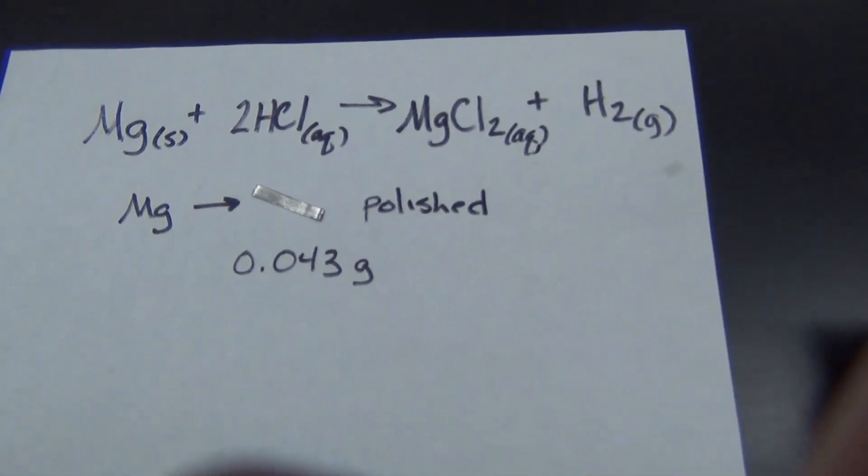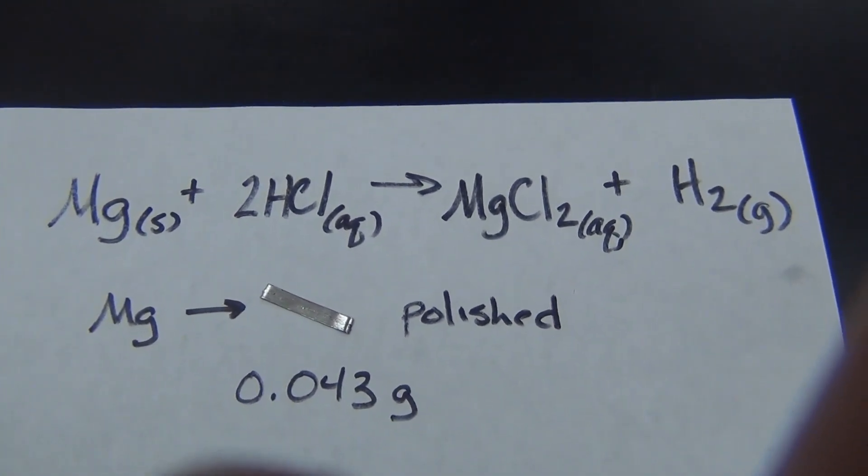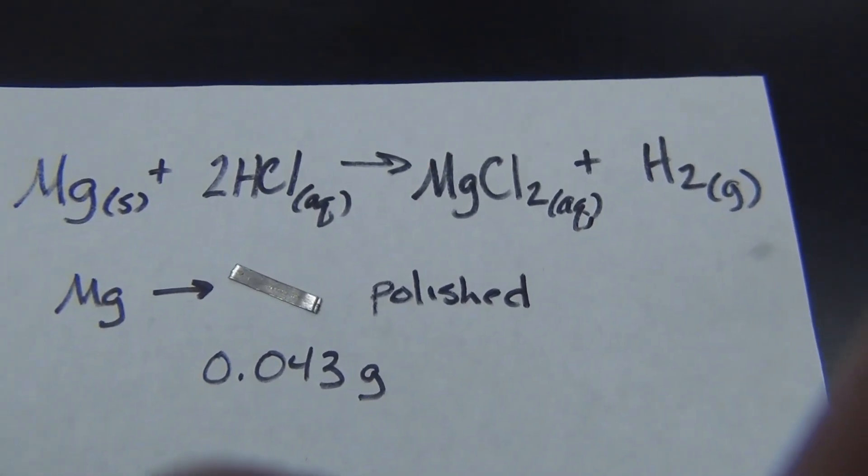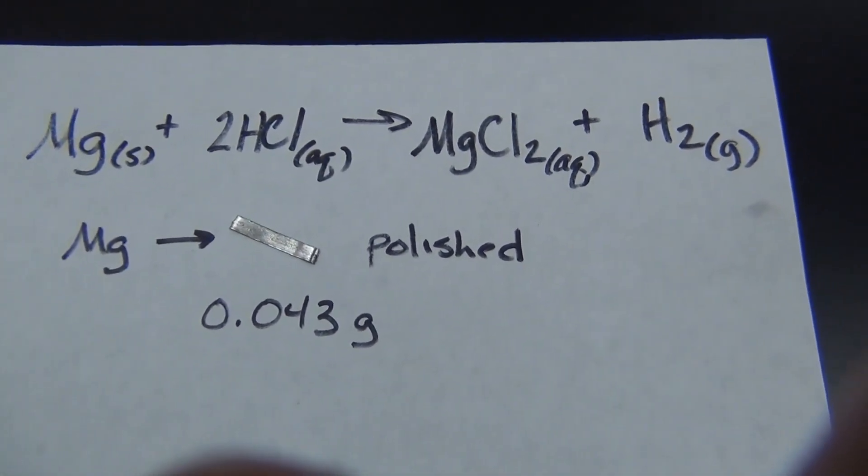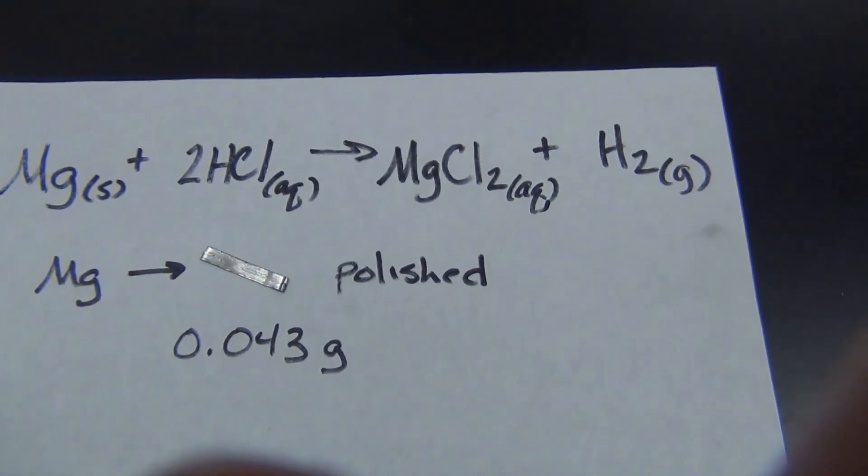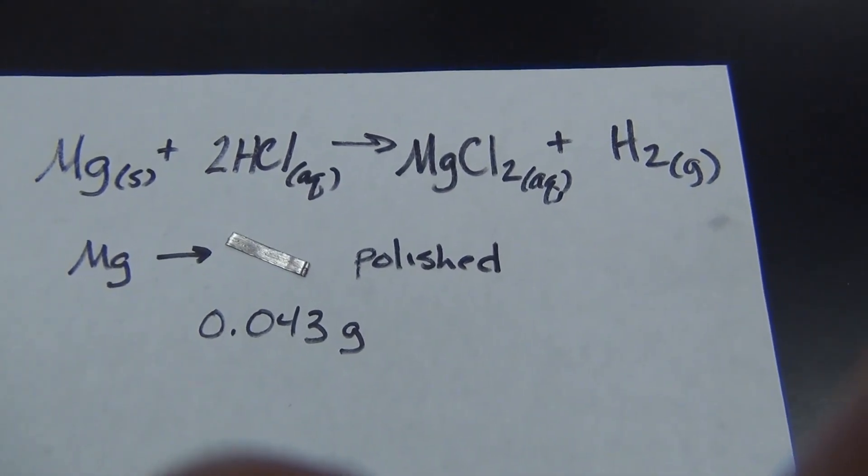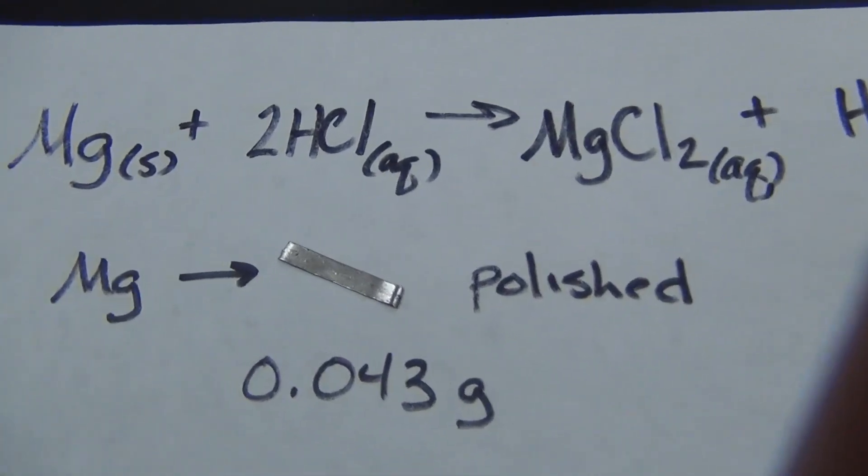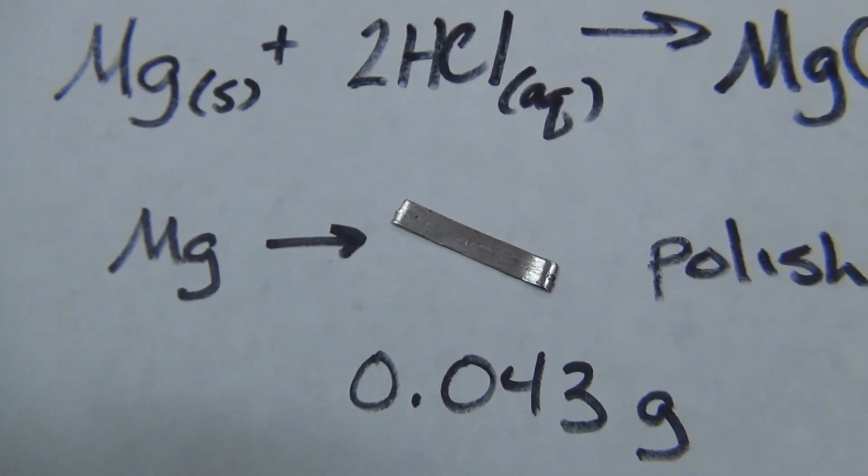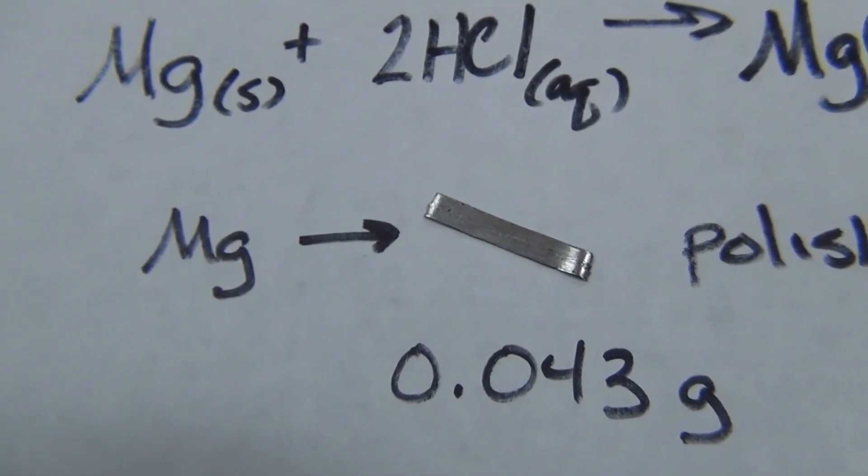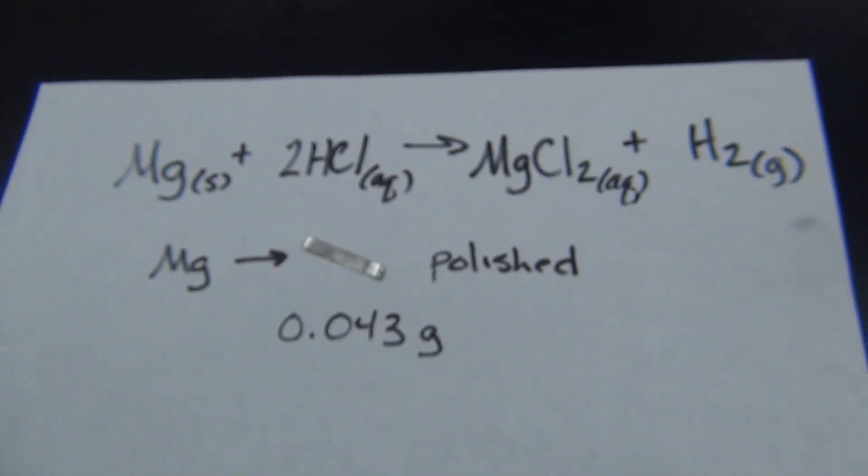So we are going to use this reaction of magnesium metal and hydrochloric acid to generate some hydrogen gas. And we're going to compare the amount of hydrogen gas we generate with what we theoretically should have made. That means we're going to need to know exactly how much magnesium we started with. I have taken this piece of magnesium, I polished it with some steel wool to get any fingerprints or tarnish magnesium oxide off of it as much as I could. Then I went ahead and put that carefully on our milligram balance. The milligram mass of this is 0.043 grams or 43 milligrams.